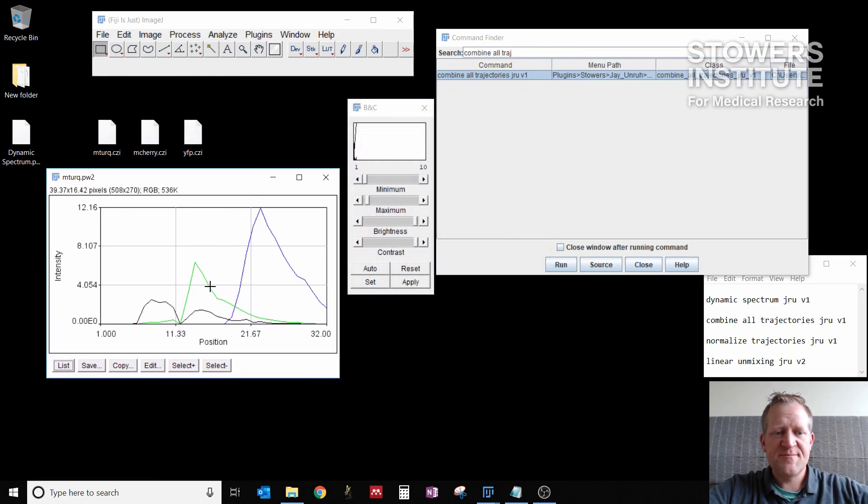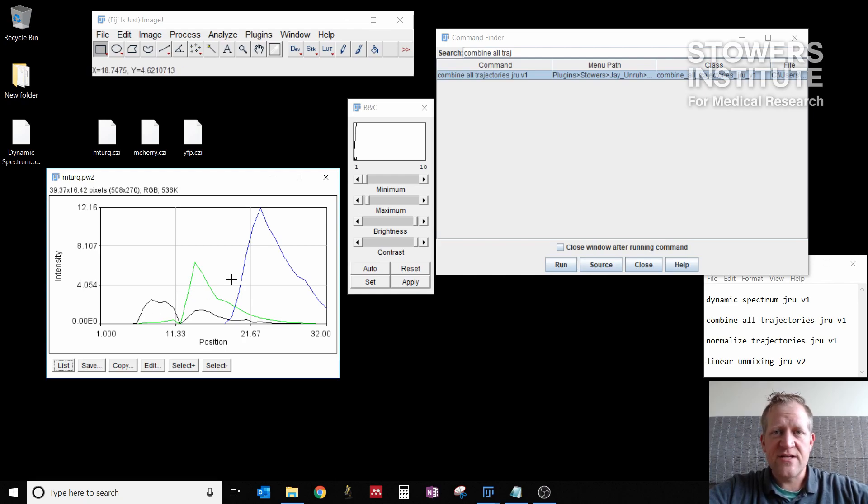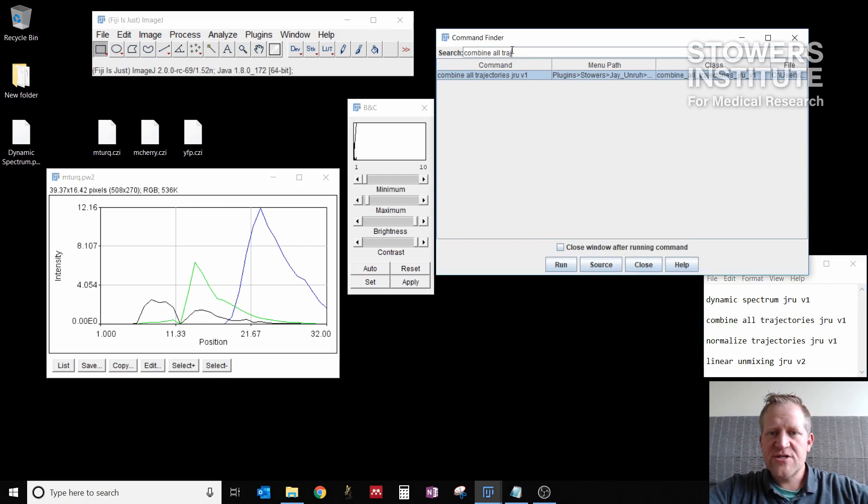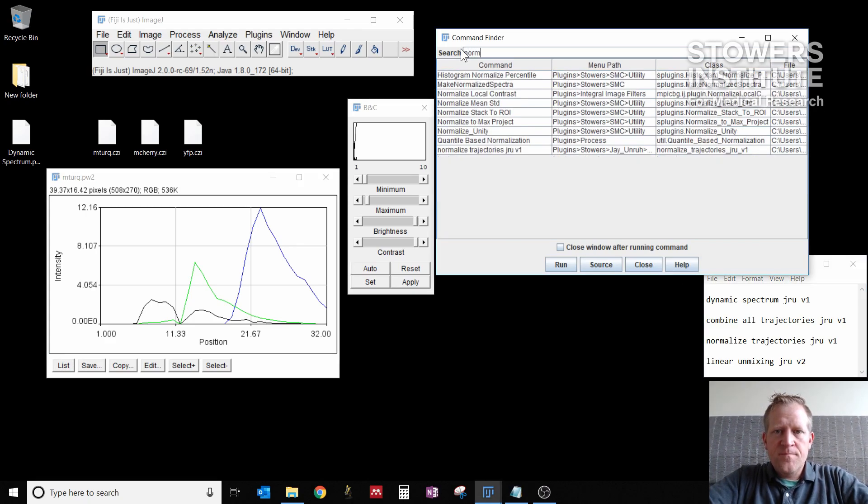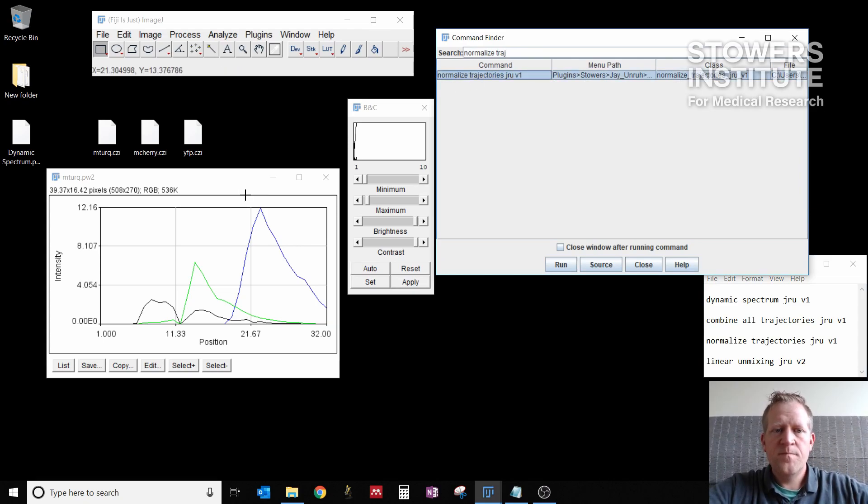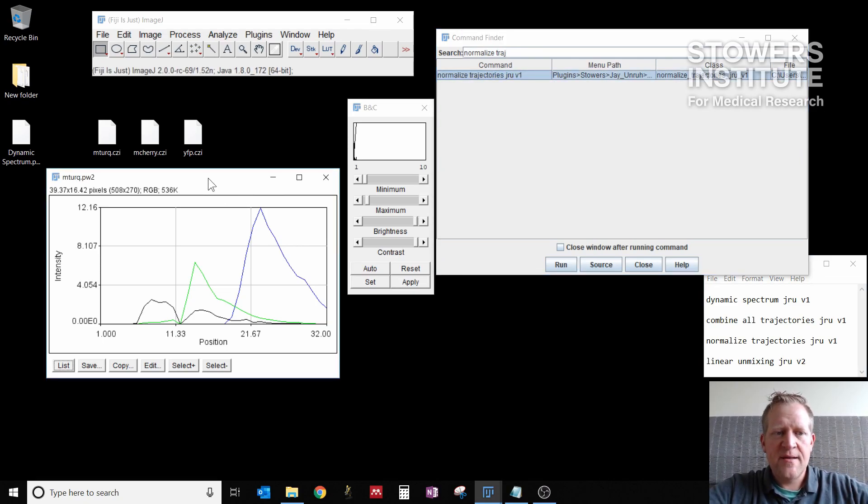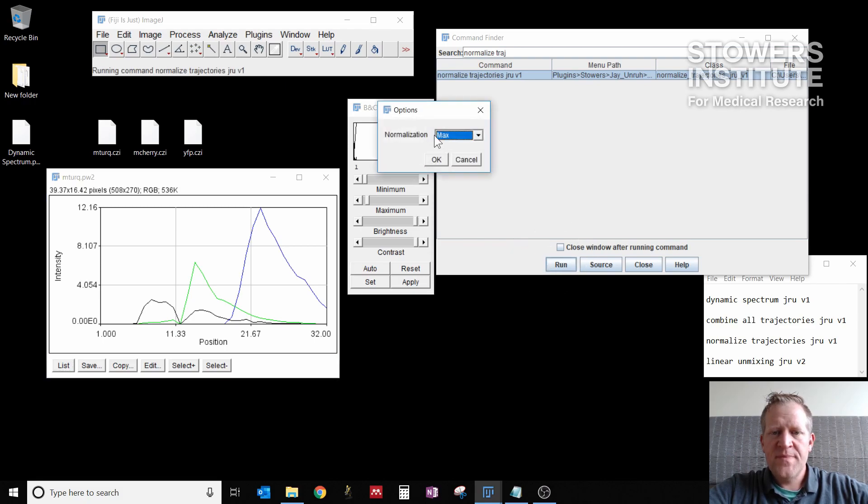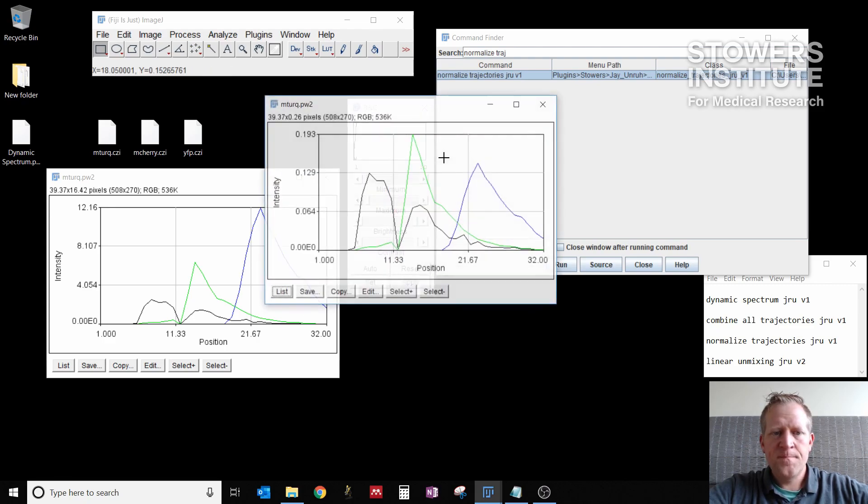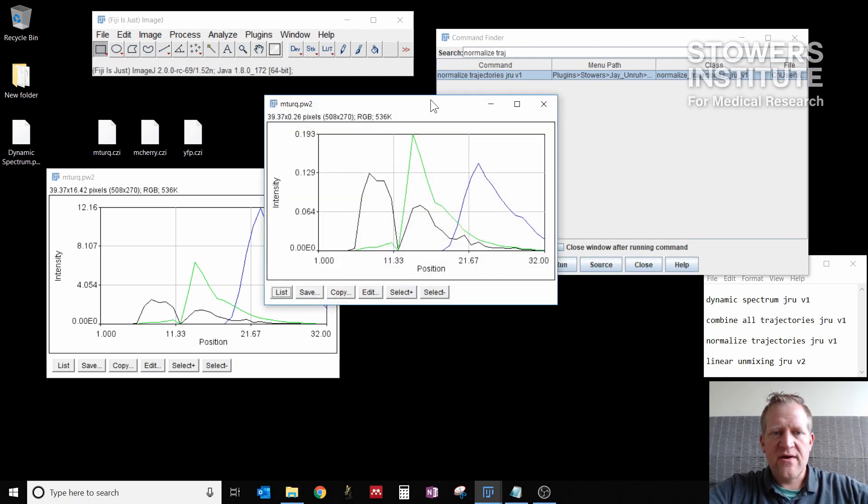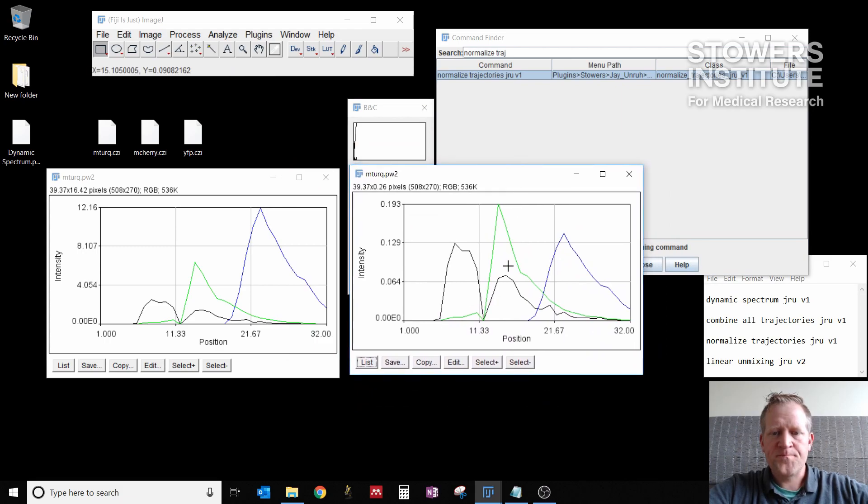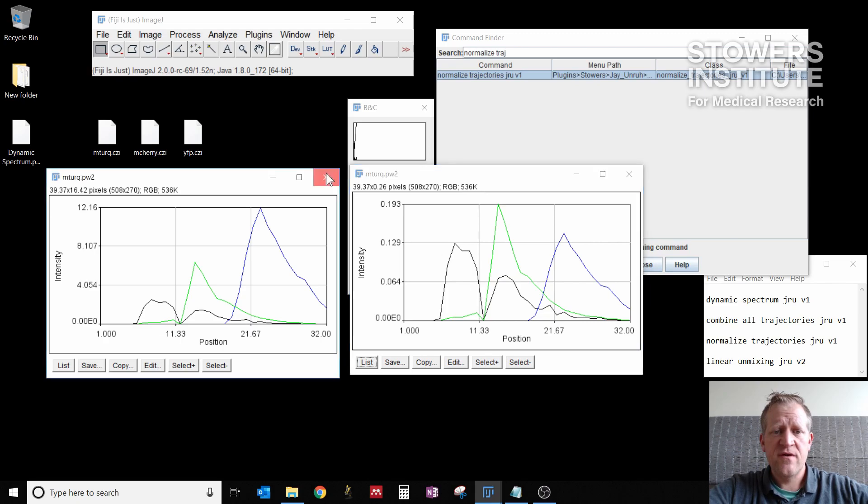That's nice, but they're on different scales due to the intensity of each image. So I want to normalize these spectra. I'm going to do normalize trajectories JRUV1. I highlight that plugin, I click on my window and I click run. I have an option here for what I can do the normalization on and we want to do integral. So I click OK. And now I have a new plot window that has all three spectra normalized to the integral under each curve.